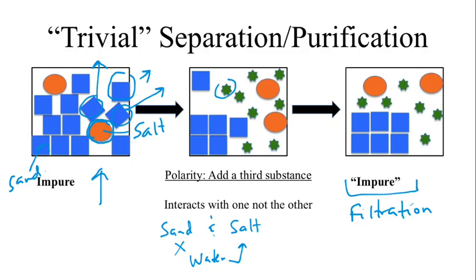Well, how do we do that with the sand and the salt? Well, we could mix it. That'll work. Stir it around really well. Try and get those layers to mix as much as possible. But let's be really, really ornery here. And let's say that this is what I've got. Okay? So here's my sand block. Okay? So it's solid sand all the way around that. And there's my salt molecule right in the middle. How do I get that salt molecule out?